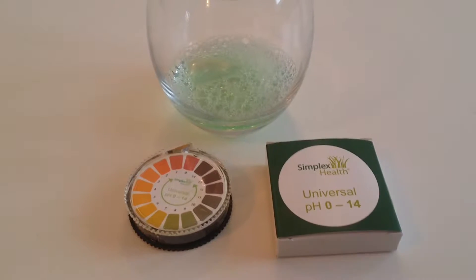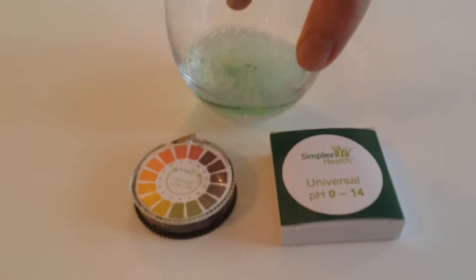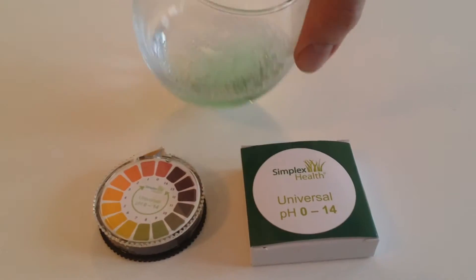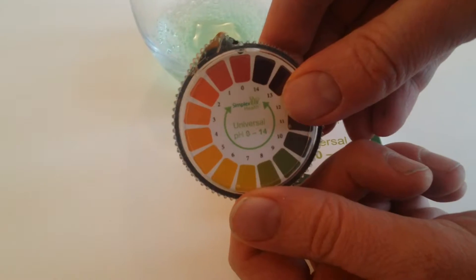John here from Simplex Health. Today I'm just going to do a little quick demo of showing how you test the pH of soapy water. This water here just had a little bit of washing up liquid put in, and then we're going to get our 0-14 litmus paper and dip it in and show you how you do a reading.